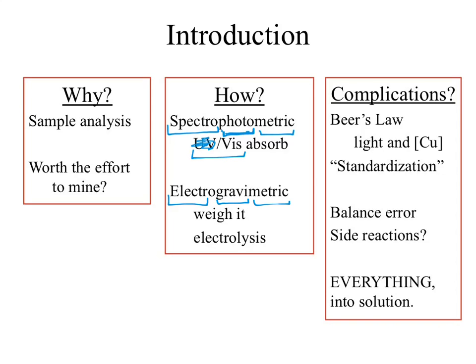That's what the electrolysis is for. So that's the electricity. One of the complications of this one is potential side reactions. If we aren't careful, we could potentially push other side reactions to occur, which could limit our yield. But for the most part, there really isn't any error associated with this. You would actually have to screw it up to get it to go wrong. So it's a pretty straightforward one.